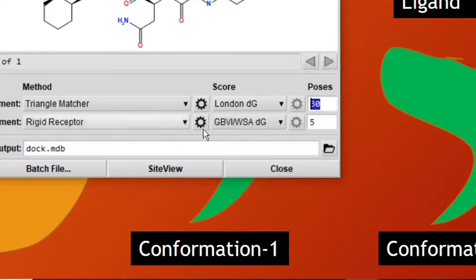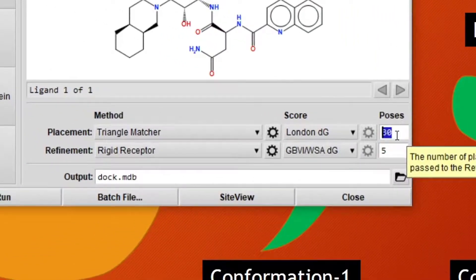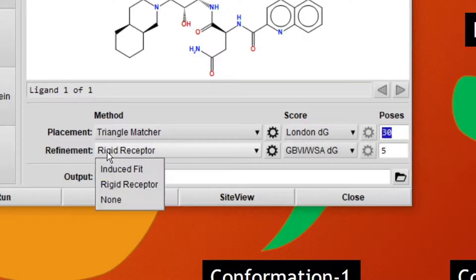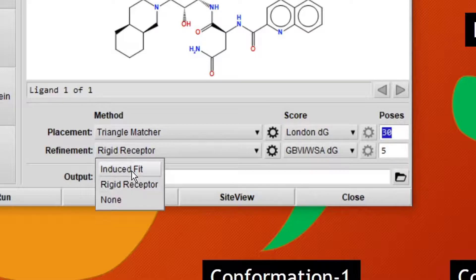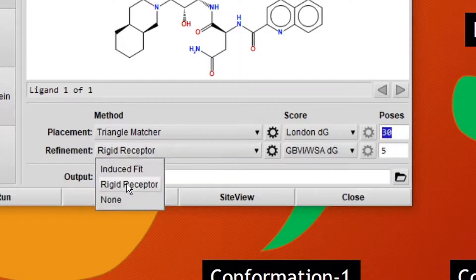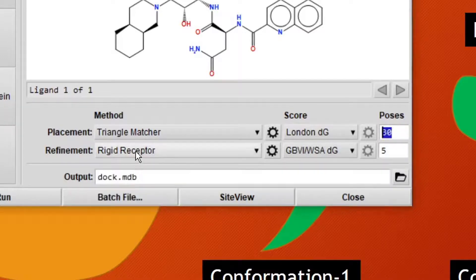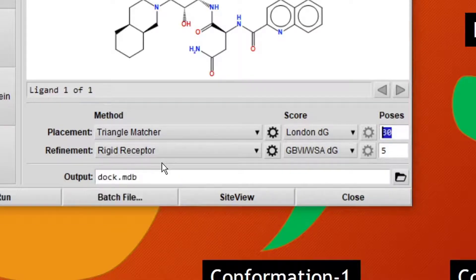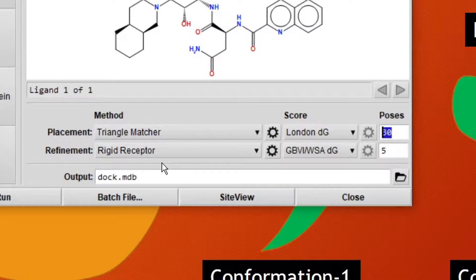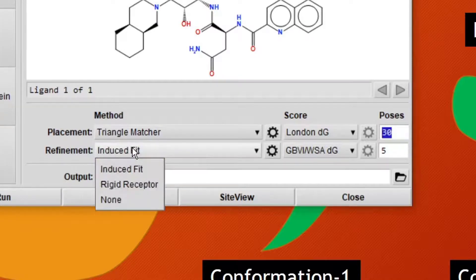These 30 conformations will be refined in the refinement step. For the refinement step, we will use two different methods: one is Induced Fit and the other is Rigid Receptor. For this tutorial, we will use Rigid Receptor because Induced Fit will take a long time. Usually the protein is dynamic and changes its structure with time, so we must use Induced Fit docking method in refinement, but it takes a long time.